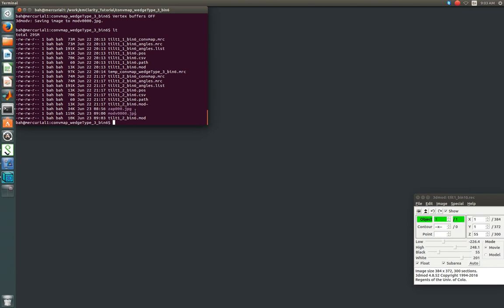I shouldn't have saved these images, I'm not sure how that happened. I must have hit ctrl S or something. But in any case, that is editing, I hope that was useful. And if you have any questions, please post them. Thanks.